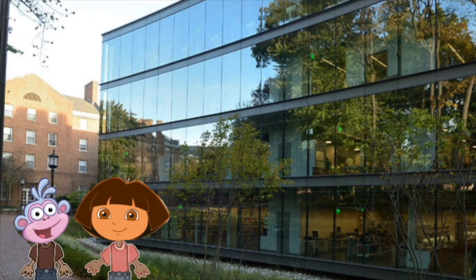Well, Boots, that just about wraps up our day at the lab. Hope you learned a lot about spectroscopy. Yeah, I definitely did. I never knew there were so many different ways you could use it. Yeah, for sure. And we barely even touched the surface. There's flame spectroscopy, mass spectroscopy, so many things we haven't even talked about.